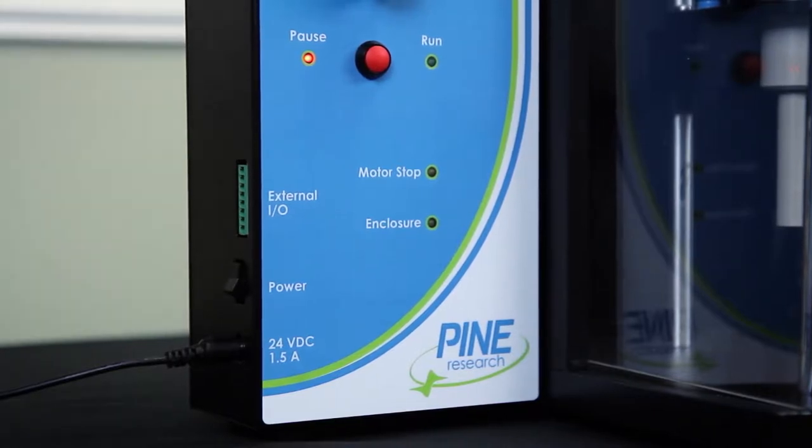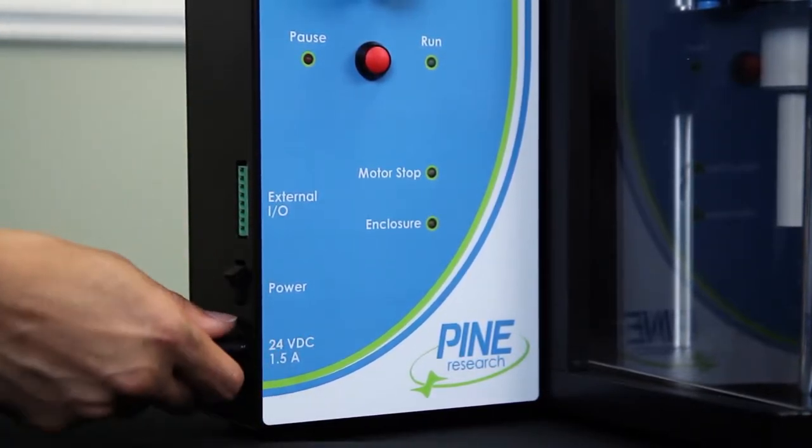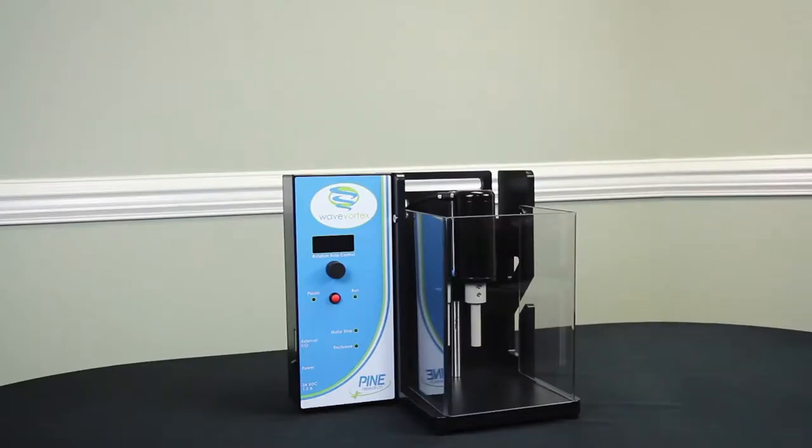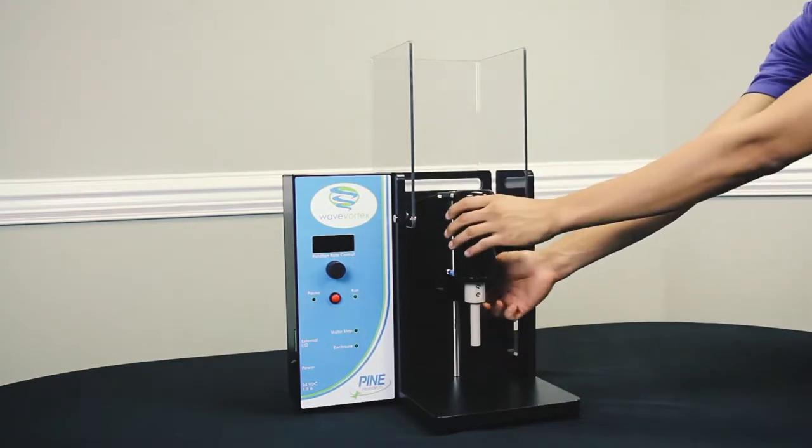First, make sure the Wave Vortex is turned off. It's easier to work with the enclosure window lifted and the motor unit positioned at the top of the support rod.